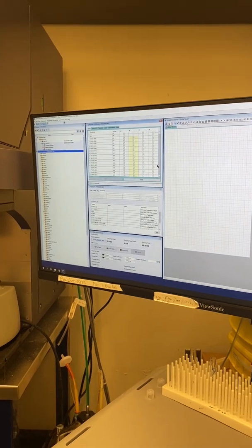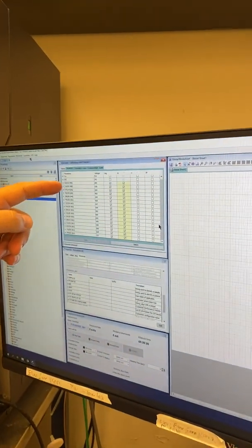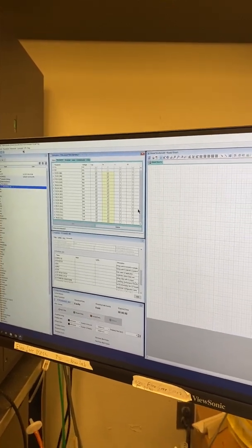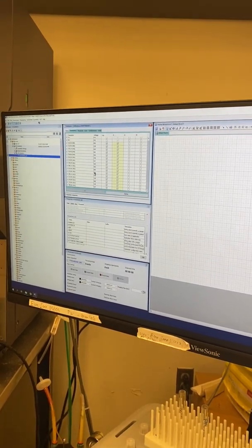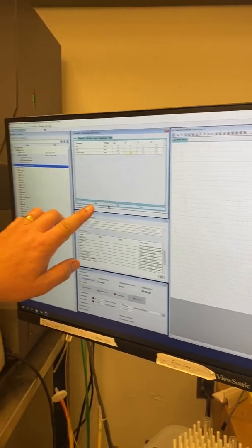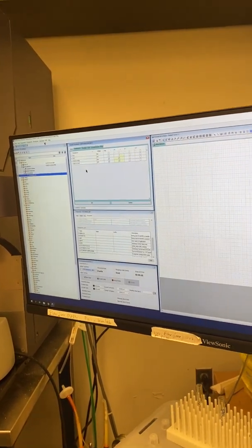June 30th. As you can see on the Fortessa, in the cytometer menu, there's a whole bunch of different parameters that the Fortessa can accumulate and acquire. We suggest that you delete the parameters that you are not using and focus on the ones that you are using. So for today, it's a simple 2-color protocol that we're going to draw. I'm just going to select everything and click delete, and then I'm going to go back and add the PE parameter, because that is the simplest parameter that we can use with FITC.